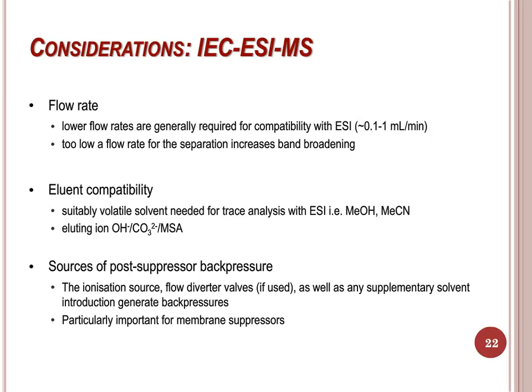As I've mentioned several times when discussing the different modes, it is also important to consider your eluent compatibility, not only with regards to the chromatographic resin and suppressors, but also with the mass spec and ionization source. It is also important to consider the ionization of your analyte in the eluent. For example, sulfate in a neutral eluent, such as post-suppression water, will be singly charged, not doubly, which can affect the mass you're looking for.